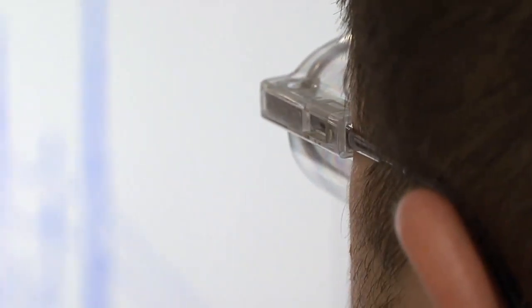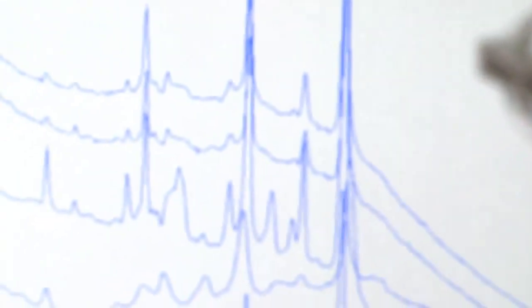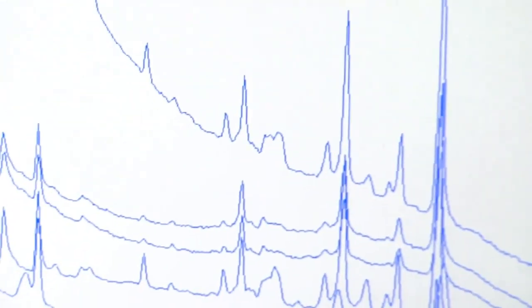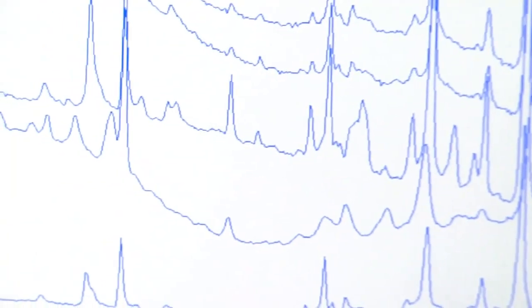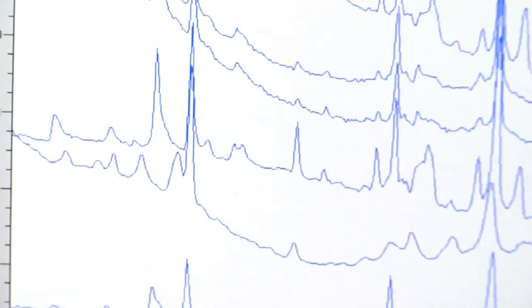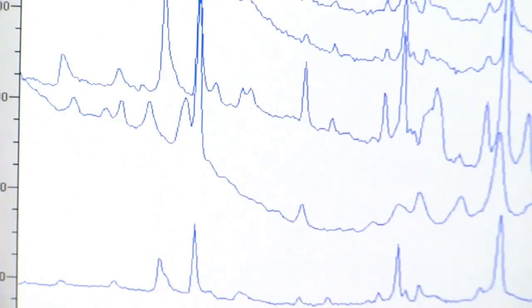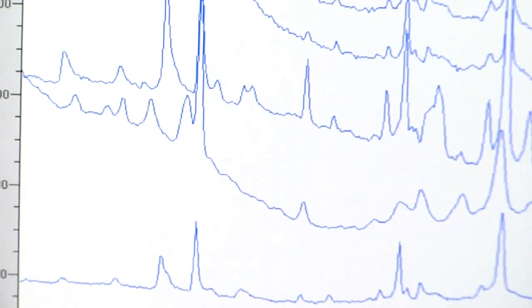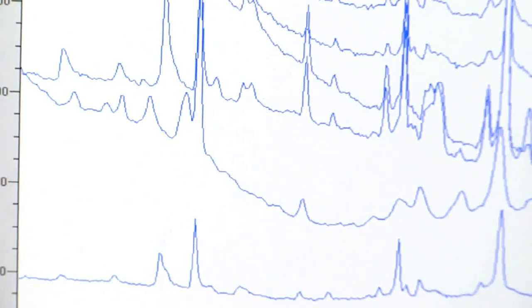This radiation passes through the microscope and into a spectrometer where it is detected and the information it contains is converted into a visual display on a computer screen. This display, called a Raman spectrum, is made up of a series of peaks of different heights that represent a particular type of chemical bond in the ink.